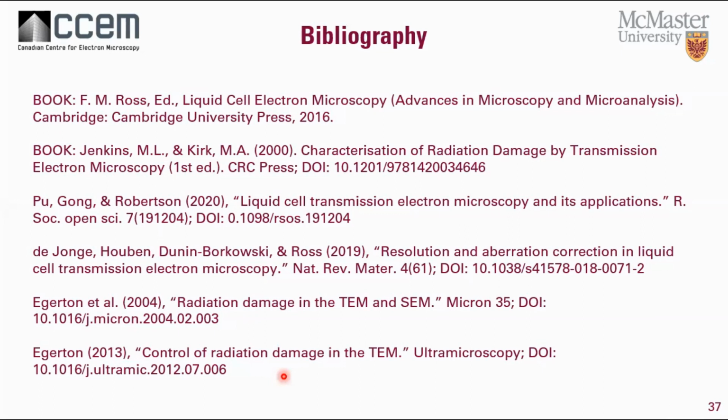At the end, I just want to show some of the materials I used for this presentation. So there are 2 amazing books. One of them I call the Bible for the liquid cell, the book of Francis Ross. And there are so many good reviewed papers actually published not too long ago, and we have lots of good papers from Ray Egerton, which talk about the radiation damage in the materials.